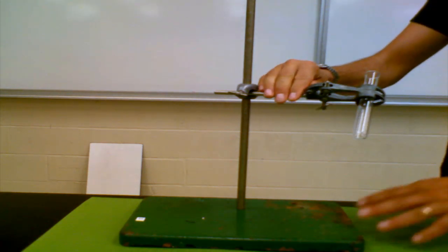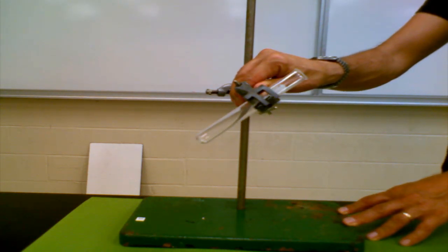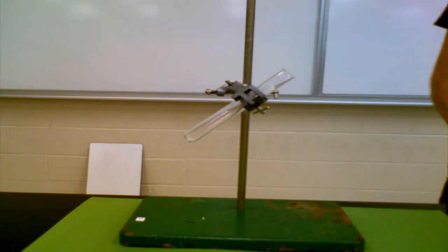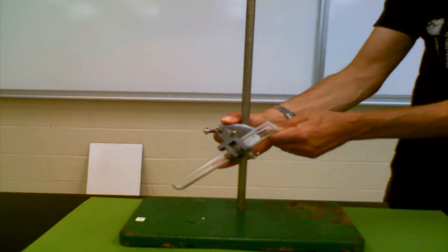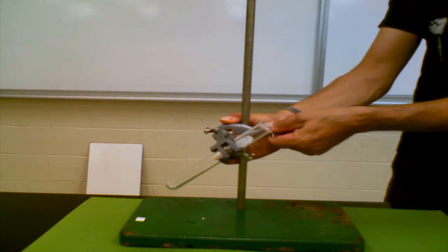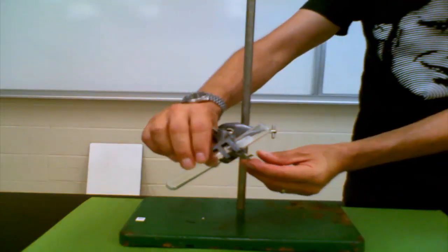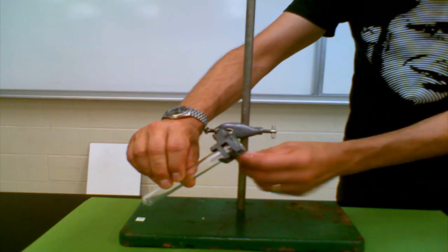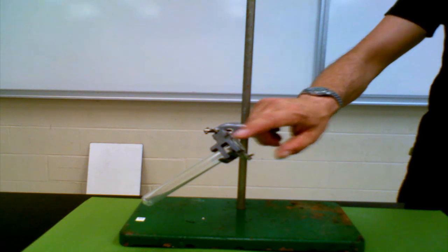Now many of you are going to want to put the test tube in the clamp in the middle. You want to avoid doing that because you don't know what's going to happen to the test tube when you're heating something up. So the safest thing to do is to slide that test tube down so that the lip is sitting right on the edge of the clamp.